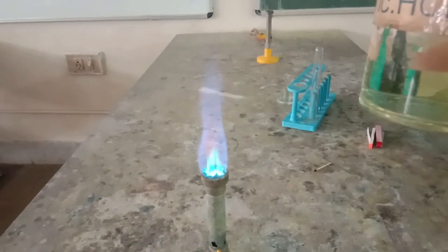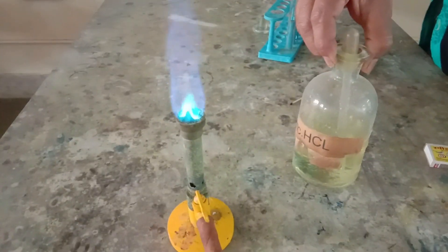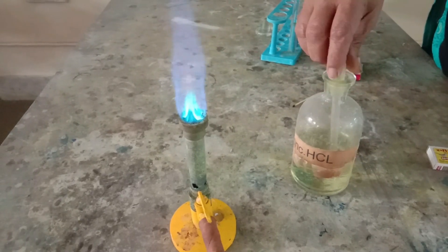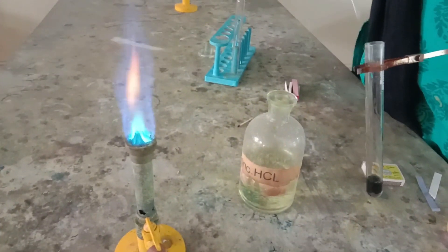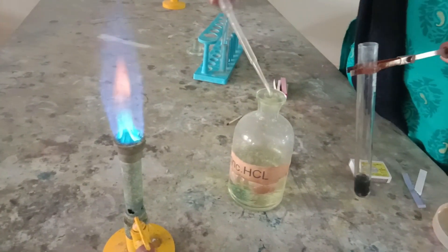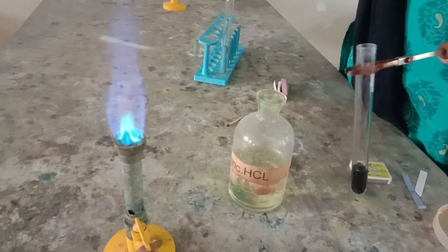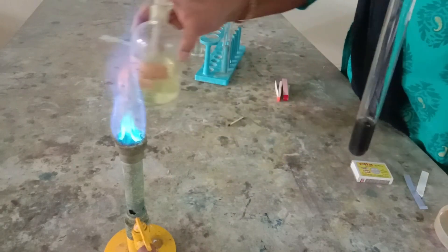Let's ignite the Bunsen burner and very carefully add some amount of concentrated hydrochloric acid with the help of the dropper into the test tube. We will need to heat the contents in the test tube.